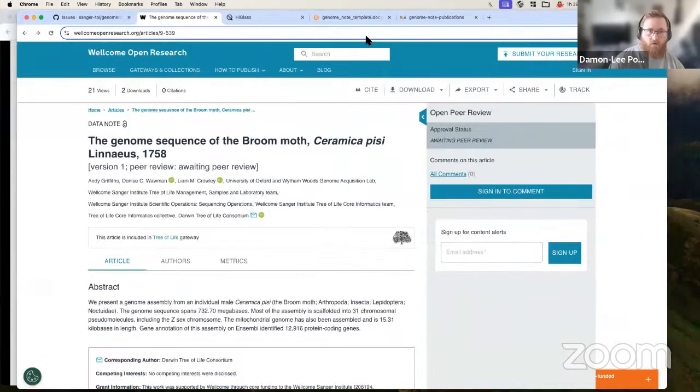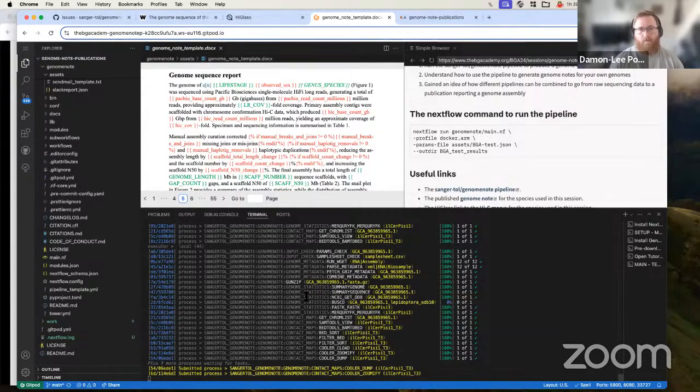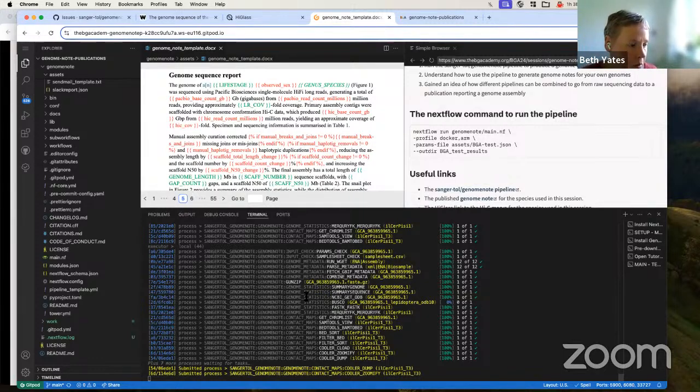So does that mean your data already needs to be up on a public database prior to running it? It does. That's the only restriction to running through the Universal platform: we require all the data to have been submitted. If you want to run the pipelines on data that's not public, there is a way of doing that. You can override, you can specify some of the parameters rather than have it fetch them. And as long as you've got your files locally, you can give paths to the files and run the pipelines that way. But the platform itself is being developed to work with public data.